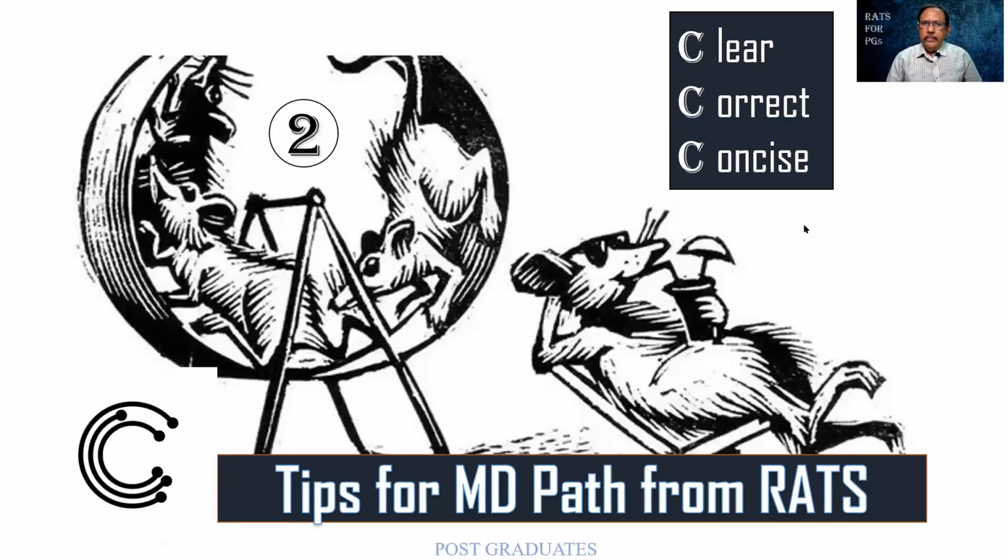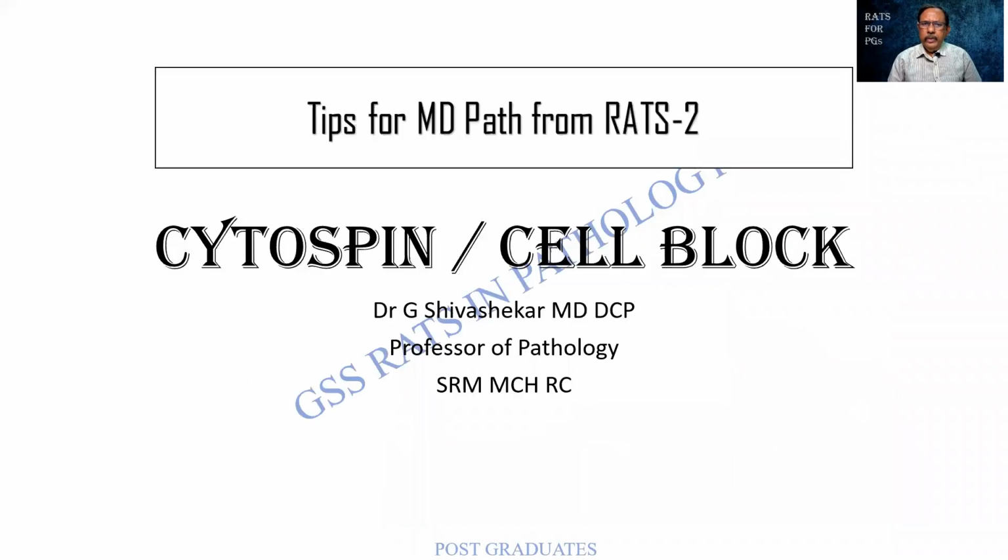My dear students, clear, correct and concise shall be the logo for the tips for MD Path students. And we shall go to the next class regarding the techniques. The topic for the day shall be cytospin and cell block. Either of these, either combinedly or as individual topics, have been asked as university questions.